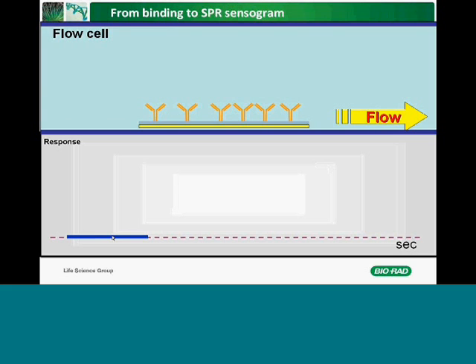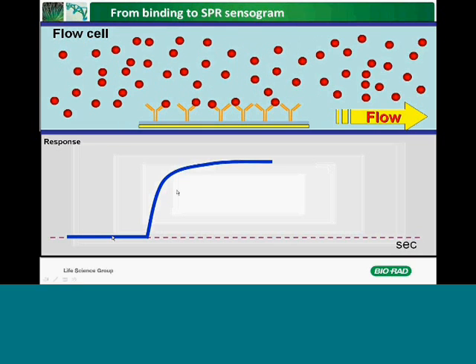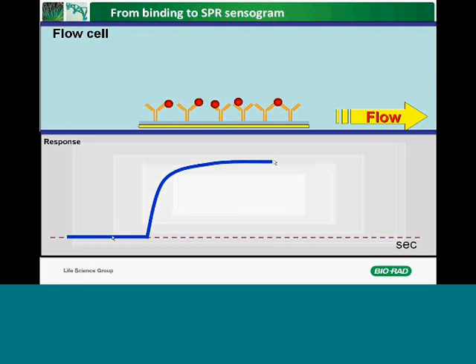And once the analyte is injected in the flow cell and it interacts with the ligand, of course you see a response. There is a change in refractive index, which is proportional to mass concentration changes over the surface, so you see a binding event curve. And once the analyte injection is finished, running buffer is back, and the analyte concentration is actually zero, so you can monitor the dissociation. So in this curve, which we also call a sensorgram, you can actually see 3 stages.